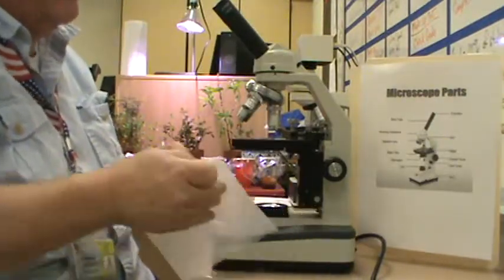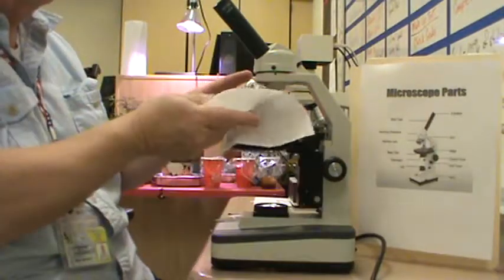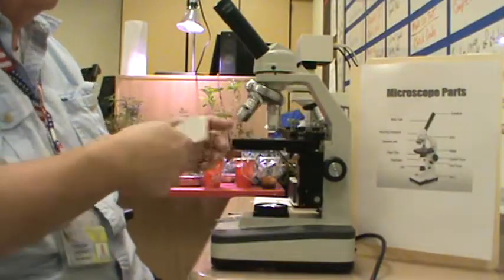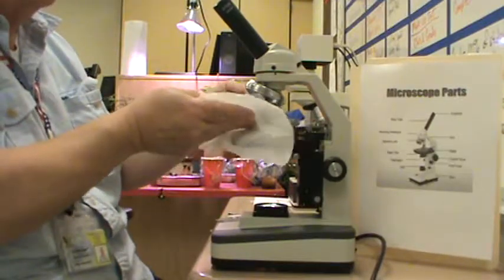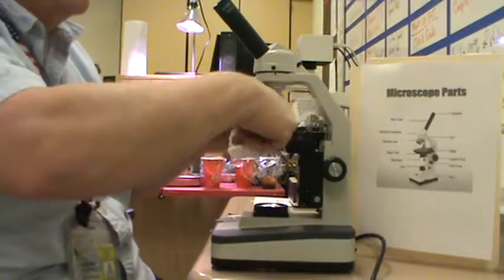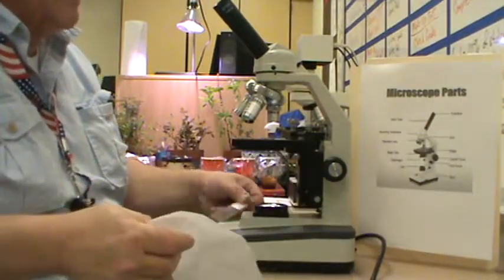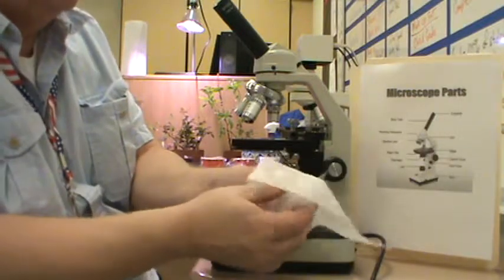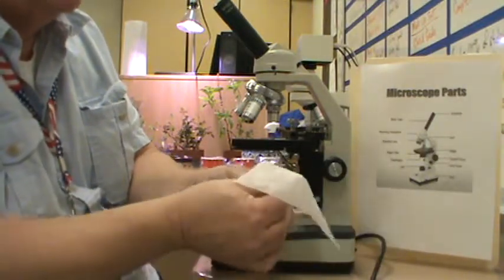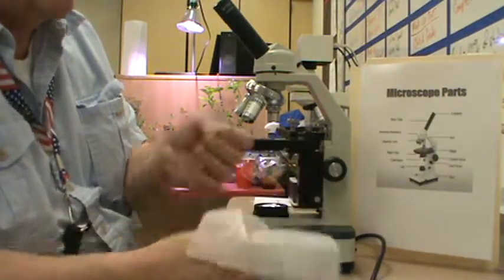Run it over the lenses just like that. If I can get up underneath, I'll do that also. And I'm going to very gently, because these are prepared slides, clean the slide off.